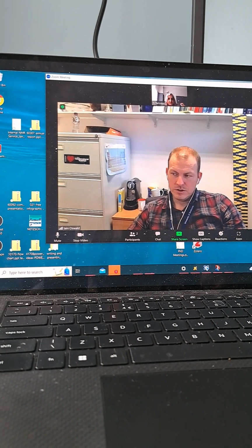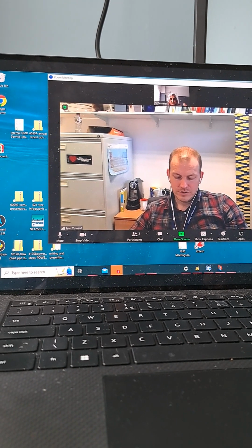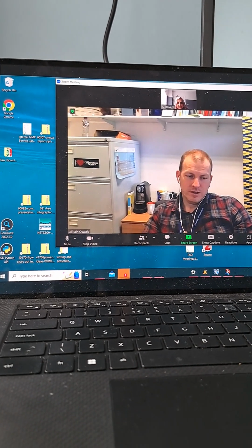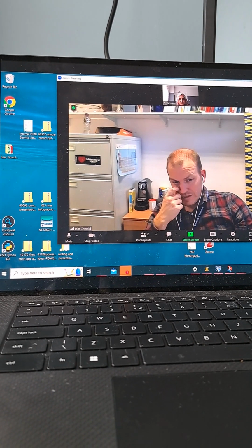As soon as the diffractometers are up and running, get that on the diffractometer, because that will help you. Hopefully it will be the same product, and then there's no need for indexing or anything like that.